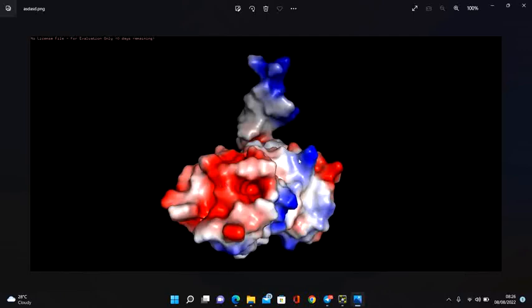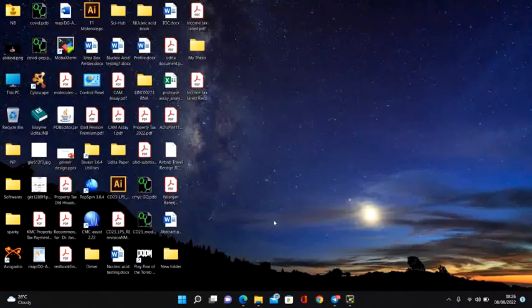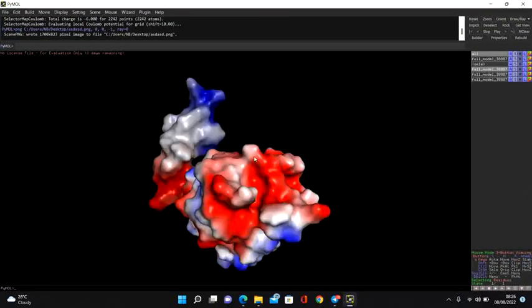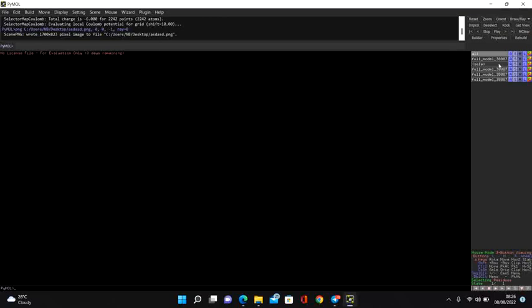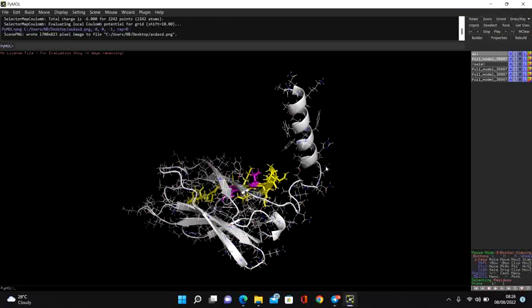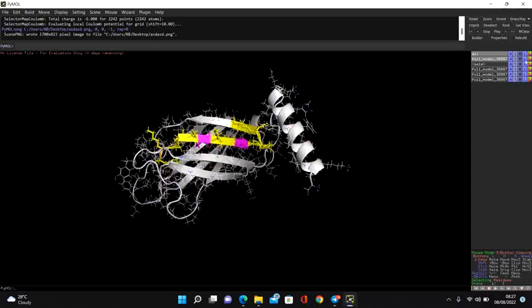So this is the other way you can save the image, because you can obviously use it in your thesis or whatever, to visualize. This is why you also require this particular thing. Even if you don't want to do anything else, you actually require it to save the image so that you can represent and show it. Okay, that kind of thing.